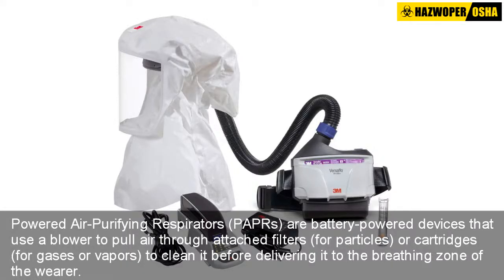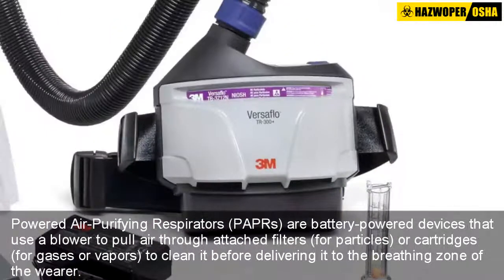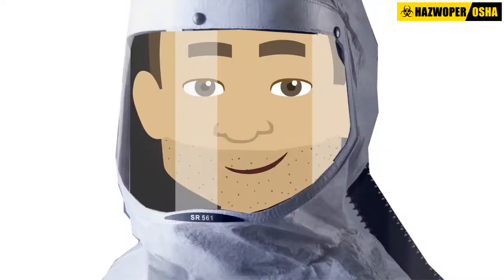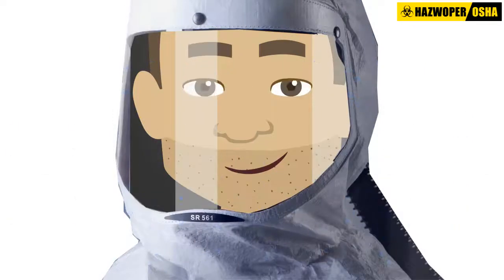Powered air purifying respirators, or PAPRs, are battery powered devices that use a blower to pull air through attached filters or cartridges to clean it before delivering it to the breathing zone of the wearer. PAPRs can be used to protect against gases, vapors, or particles if equipped with the appropriate cartridge, canister, or filter.